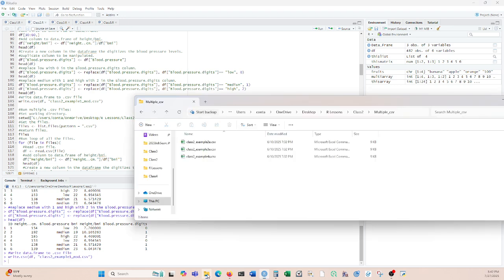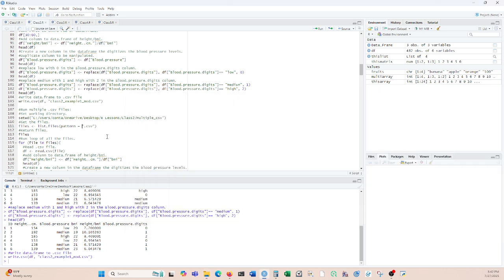So we're getting this working directory so it knows it has to pull files from here. This is very important for this part because this program basically takes all the CSV files from one folder and works with them, and you don't want it looking around, taking all your CSV files from your whole computer and trying to run it. That will just cause issues. So you need to make sure it knows where it should be looking.